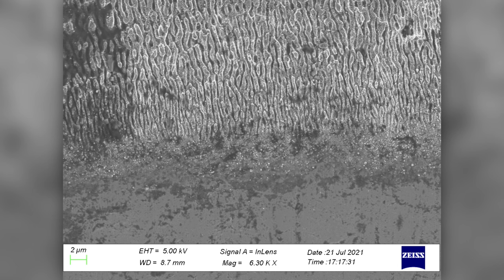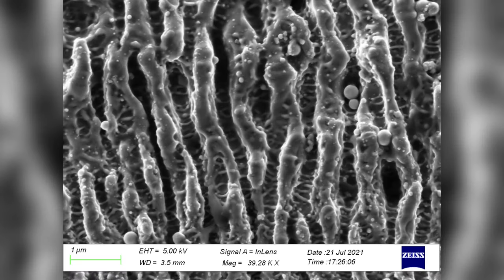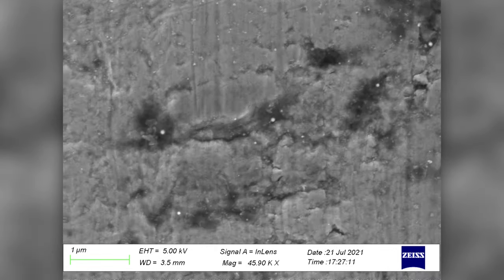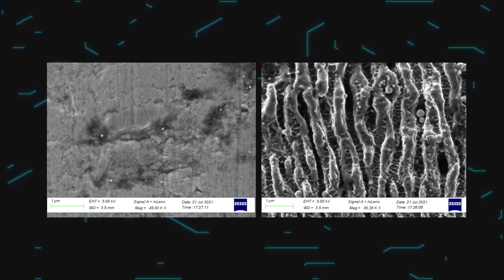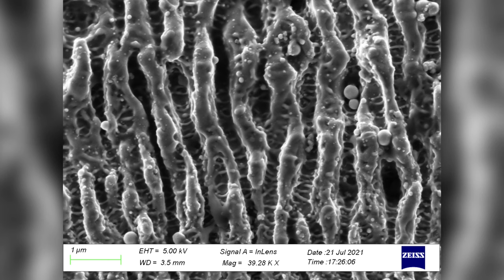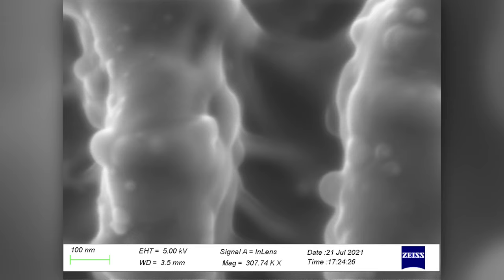This is the structure of processed and untreated steel. Now the most interesting thing — let's see what we can see if we zoom in to 40,000x. We are already in nanometers. This is the steel that the laser beam went through when it cut the letter I in the word. It's also interesting to see how the steel looked before processing — let's take a side-by-side look with the same magnification. The difference is just huge. And finally, let's look at the processed steel with a huge magnification of 300,000x. The width of this channel from the laser is only 300 nanometers.